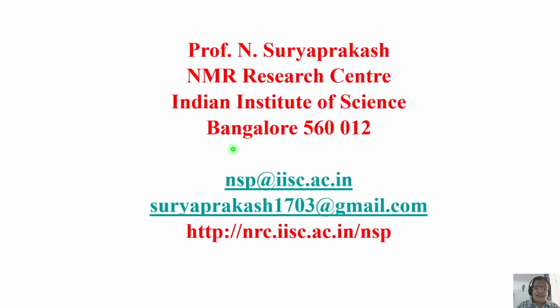In this class, we will discuss something about relaxation, like spin-lattice and spin-spin relaxation in NMR. Of course, this is a vast topic. One can discuss this for several hours, or several days and weeks. It's a huge topic and a very difficult topic to understand.